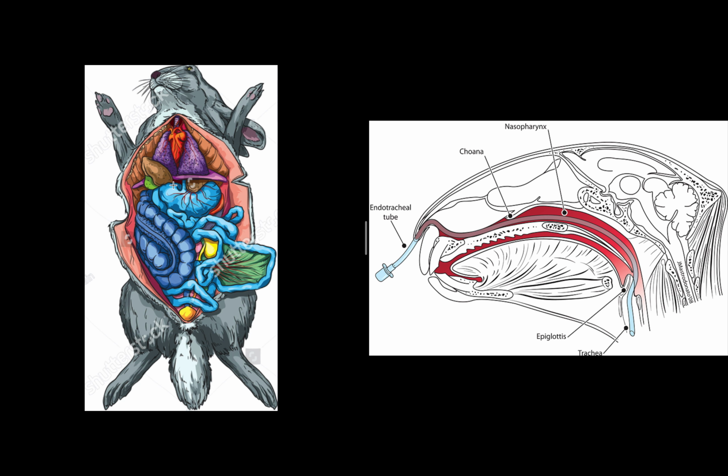Gas exchange is the delivery of oxygen from the lungs into the bloodstream, which is obviously going to then spread to the entire rabbit. It occurs in the lungs between the alveoli and the network of tiny blood vessels called the capillaries, which are located in the walls of the alveoli.